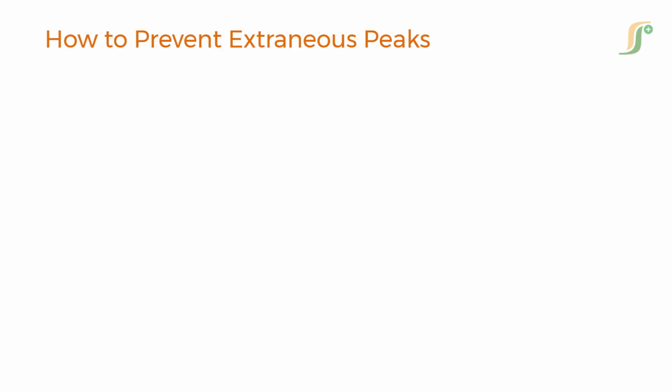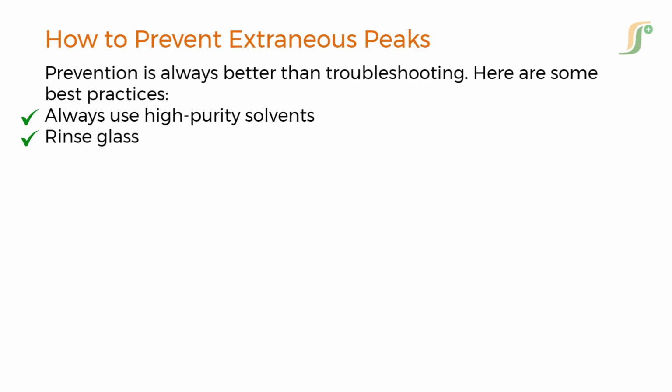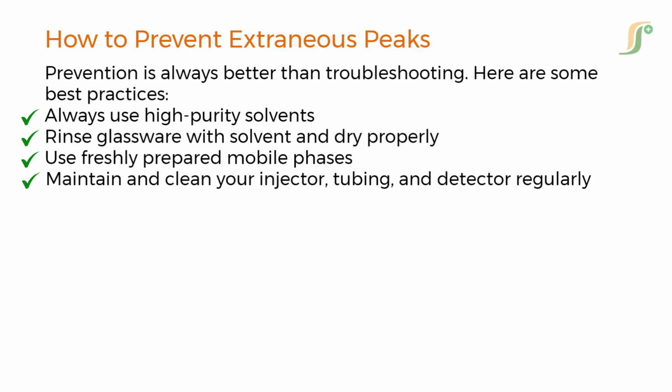Now, let us know how we can prevent these extraneous peaks. Prevention is always better than troubleshooting. Here are some best practices. Always use high-purity solvents. Rinse glassware with solvent and dry properly. Use freshly prepared mobile phases. Maintain and clean your injector, tubing, and detector regularly.